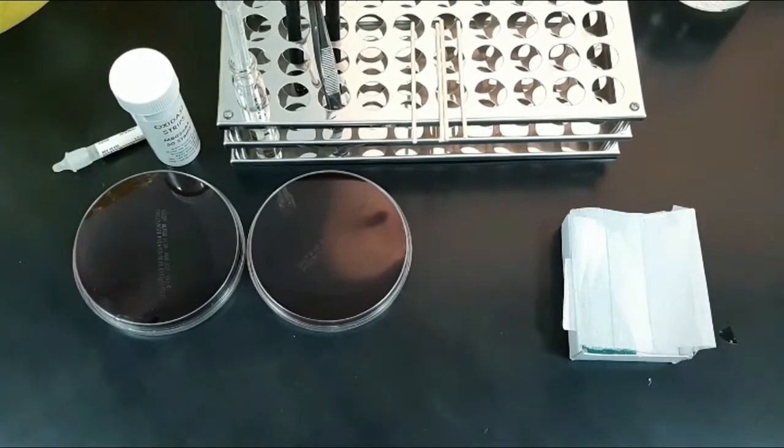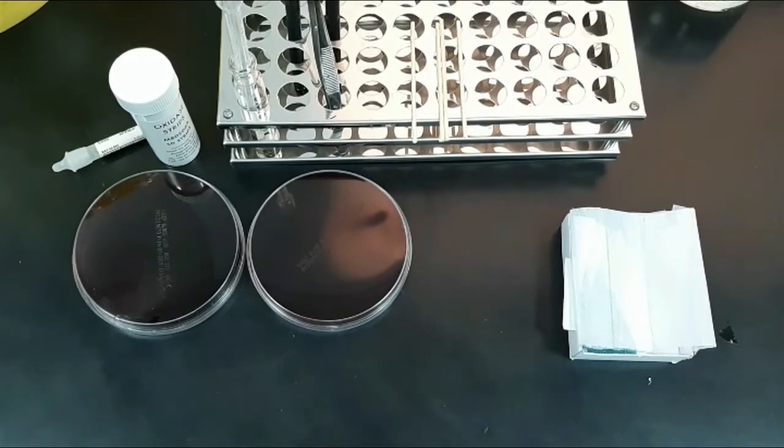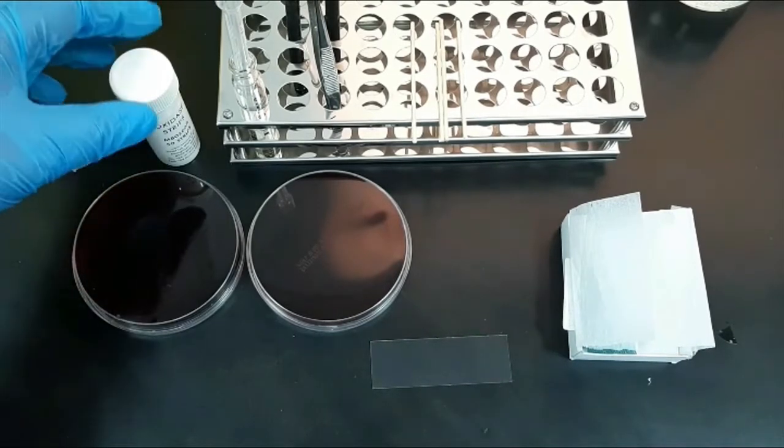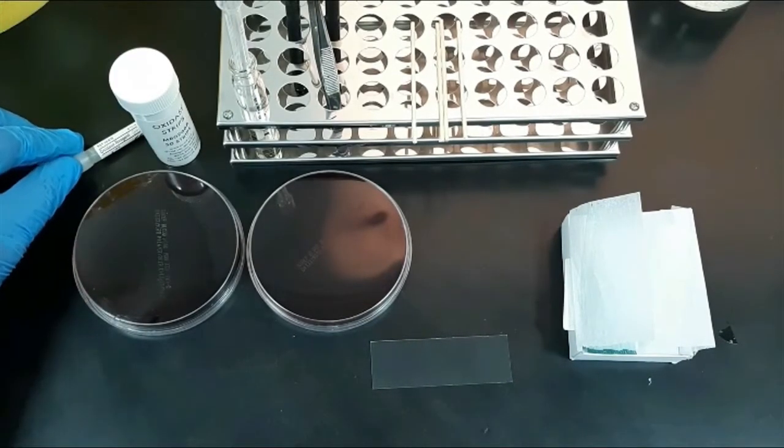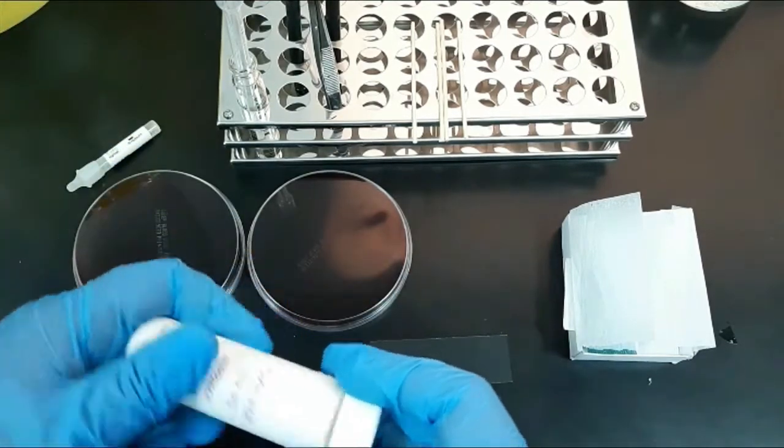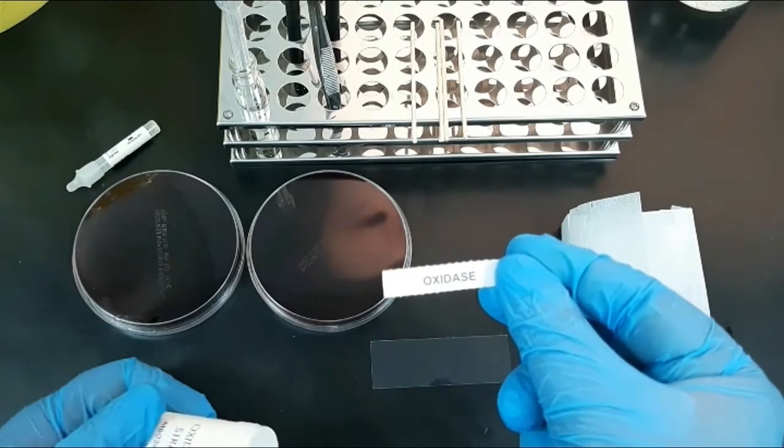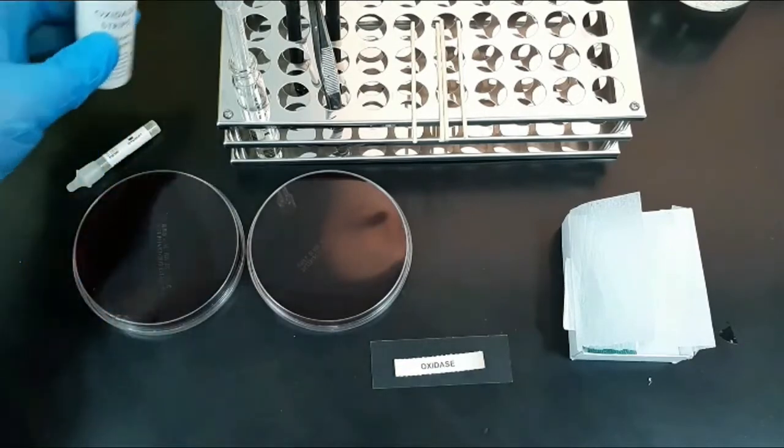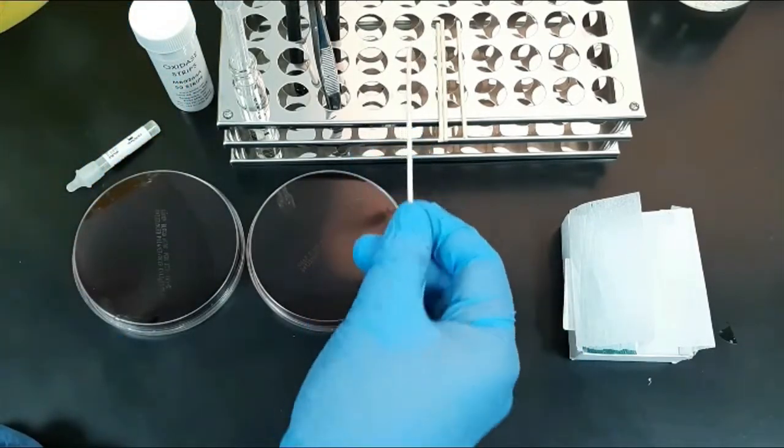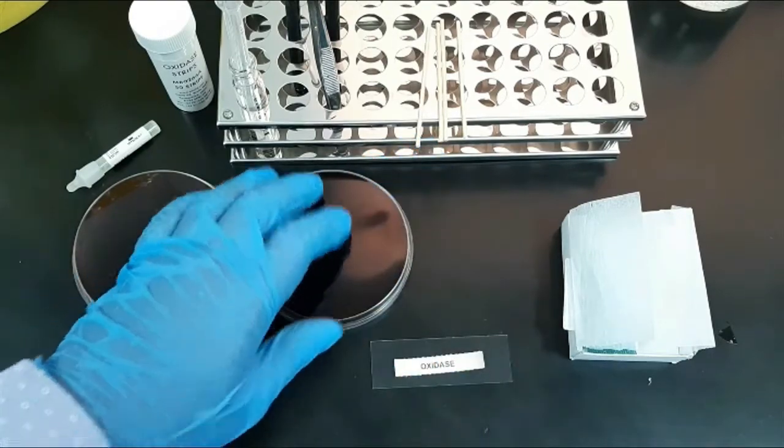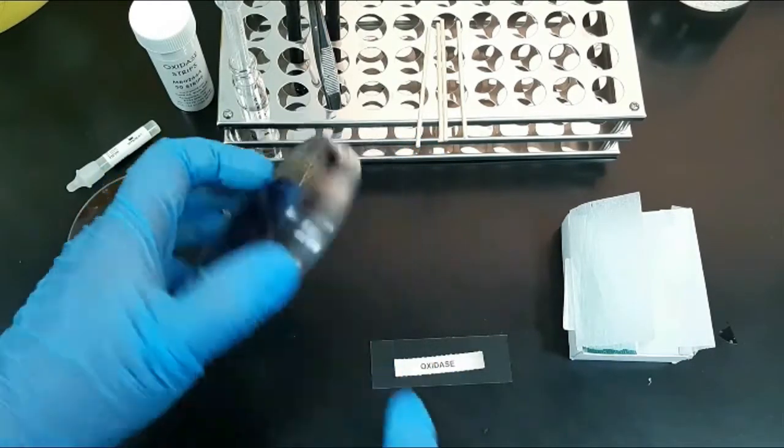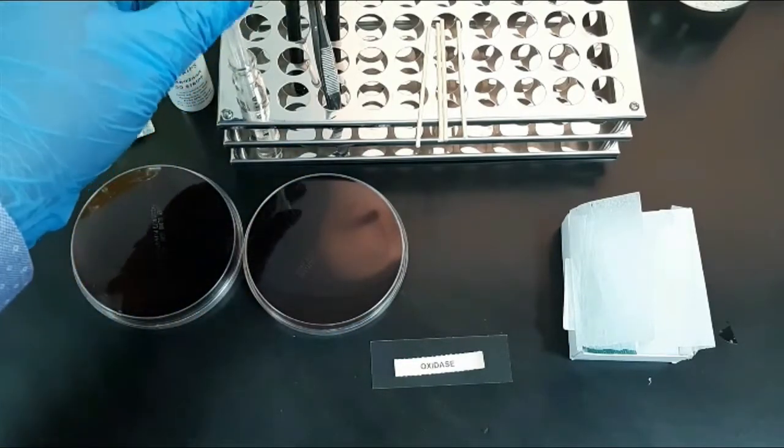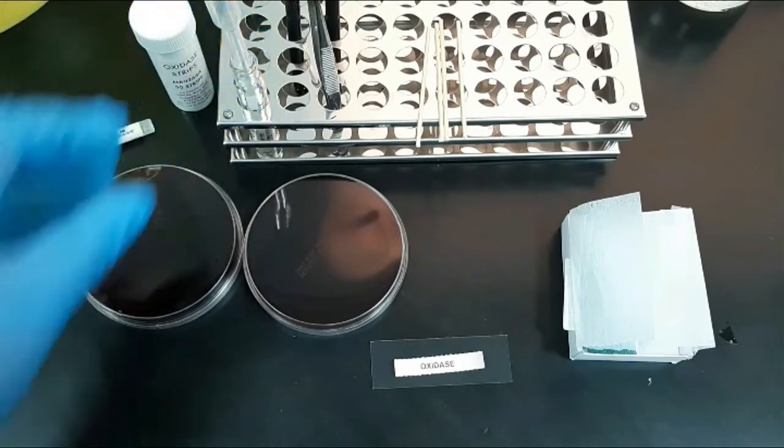For the oxidase test, first we'll see the requirements needed: a glass slide, oxidase paper strips or oxidase reagent. These oxidase strips are impregnated with oxidase reagent, tetramethyl-p-phenylenediamine dihydrochloride. We also need a wooden stick or disposable loop, bacterial culture plates—one is oxidase-positive bacteria Pseudomonas and another is E. coli which is oxidase-negative—and distilled water.